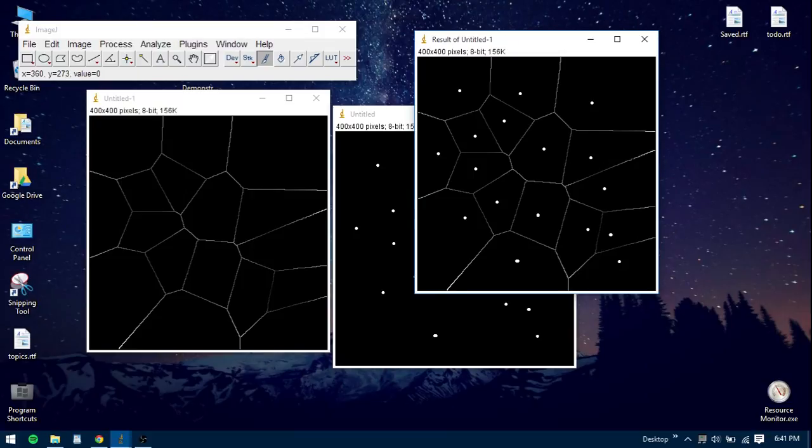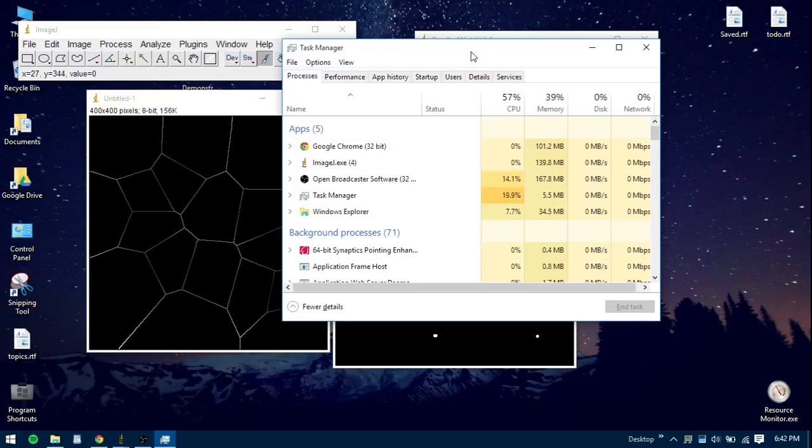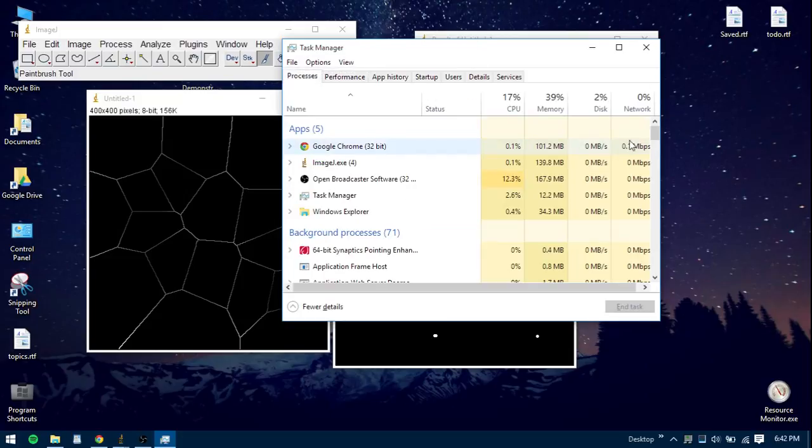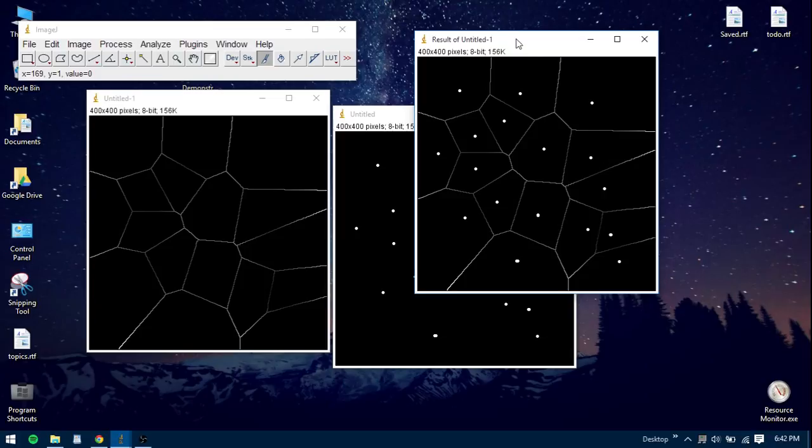And again, you want to make sure that you have enough memory in order to operate this all, and check your hardware limitations before you put on ImageJ, and just for good measure, make sure that not too many other programs are open while you do this, and of course save your work often.